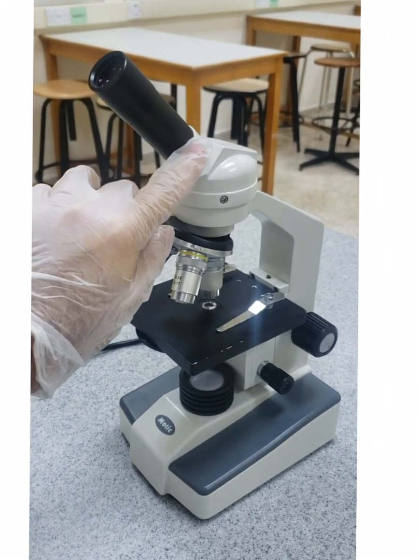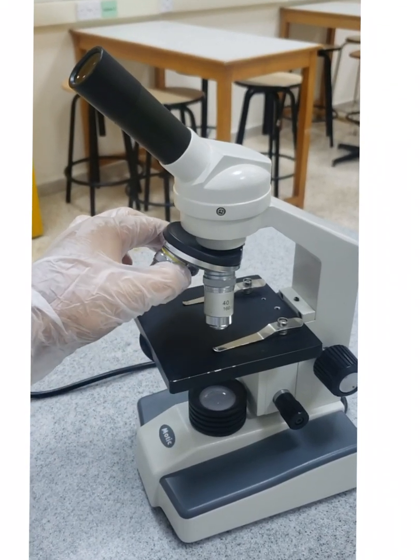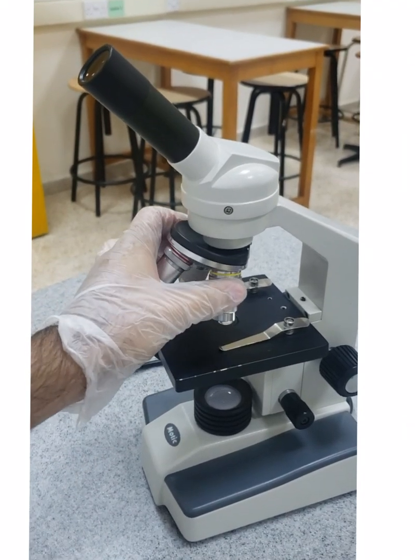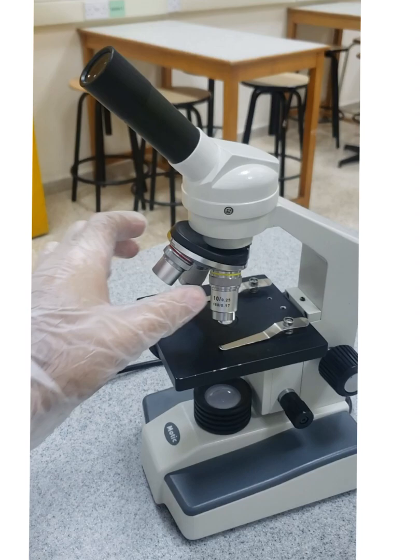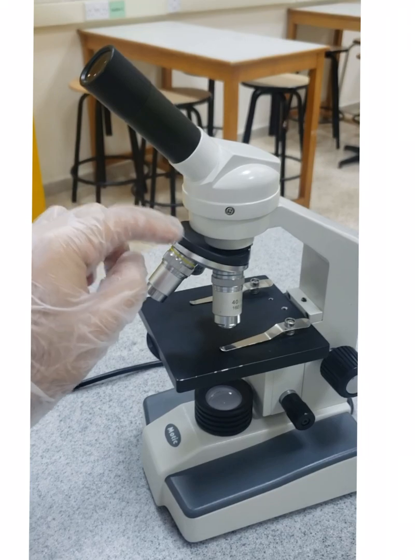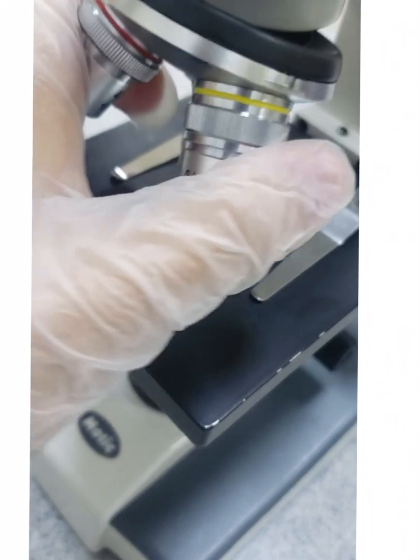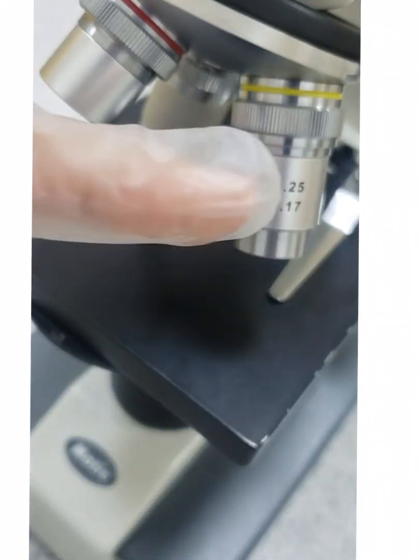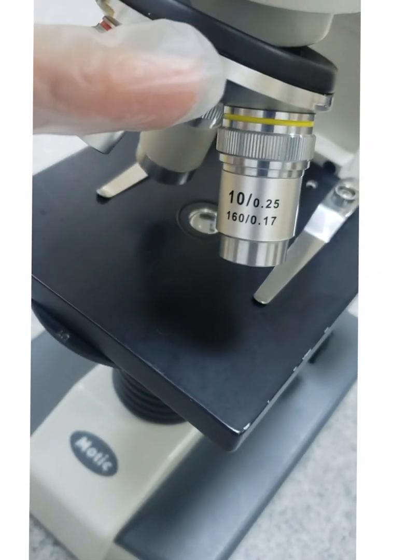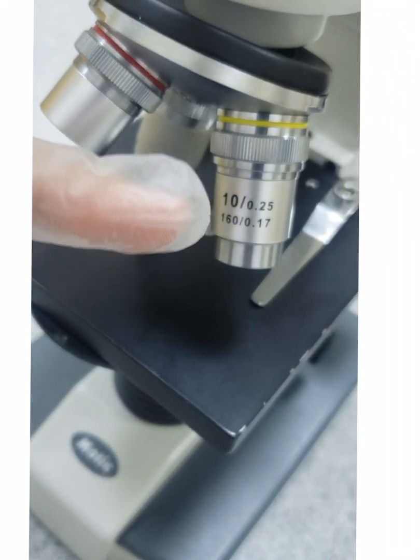And then here you have the body tube. And then here, it's like the nose, right? This is called the rotating nose piece. On this piece I have these objectives, these lenses. Each objective has a different magnification, so I can read it on them. For example, this lens has 10 times magnification. So observing any object through this objective means I am observing it 10 times bigger.